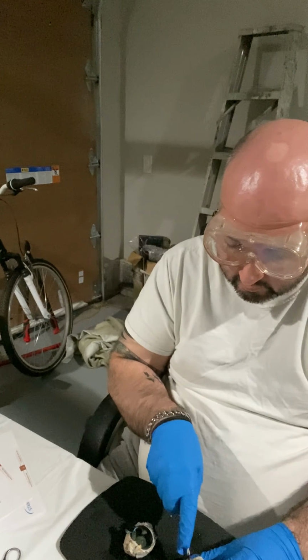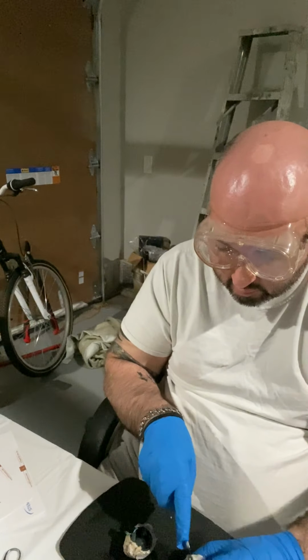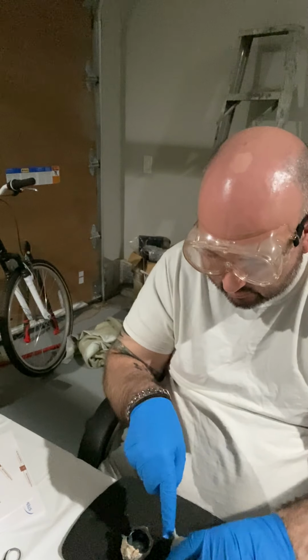I'm trying to show you what's called the vitreous humor, which is basically a gelatinous tissue or gelatinous disc that fills the eyeball behind what's called the lens.